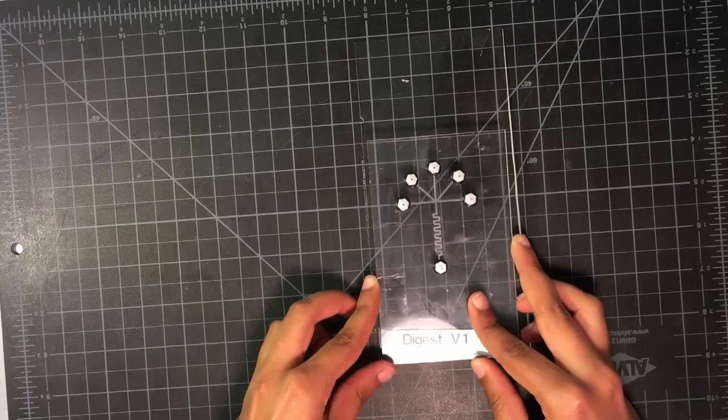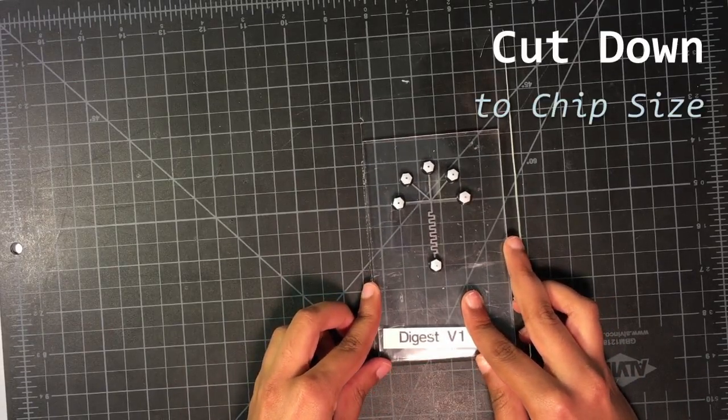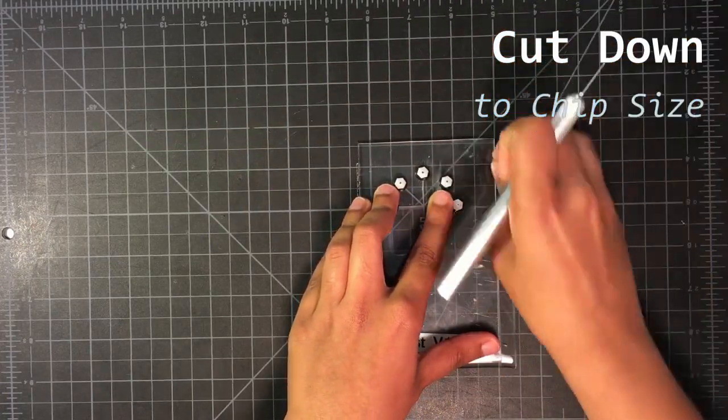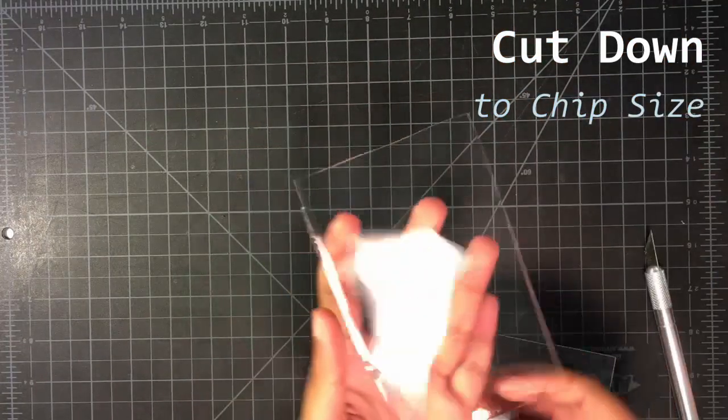Finally, place a chip of the desired dimensions on your PDMS and use the exacto knife to cut it down to size. Congratulations! You now have PDMS to use in your chip.